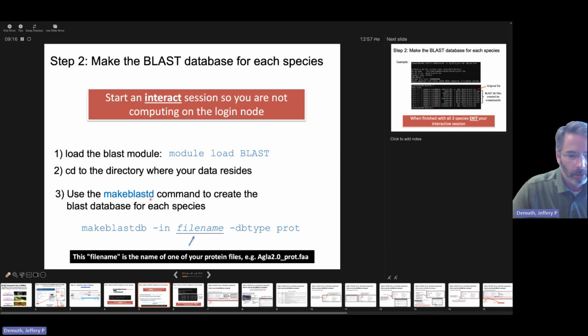Oh, that should say makeblastdb. I will fix that before I upload these slides. It's correct down here. It should say makeblastdb.